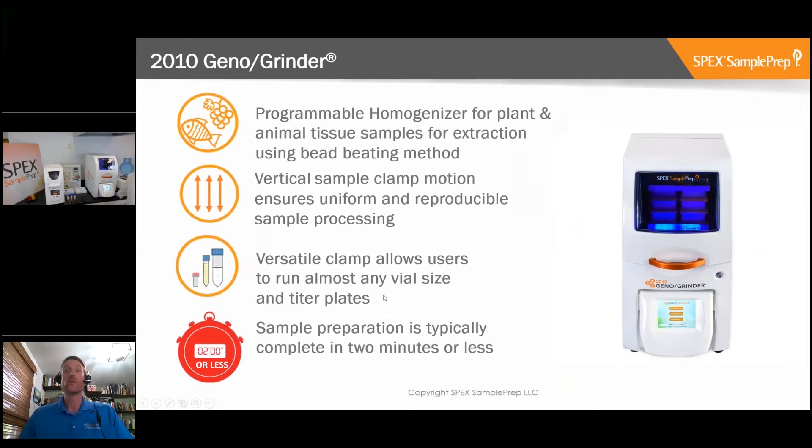The Geno Grinder is a fully programmable homogenizer for plant and animal tissue. Samples are broken up using a bead-beating method. One of the unique features of the Geno Grinder is its purely vertical shaking motion - the clamp moves up and down in a purely vertical motion, which ensures uniform and reproducible sample processing. The clamp is also highly versatile, accommodating all kinds of different vial sizes and titer plates. Sample preparation is typically done in one or two minutes.